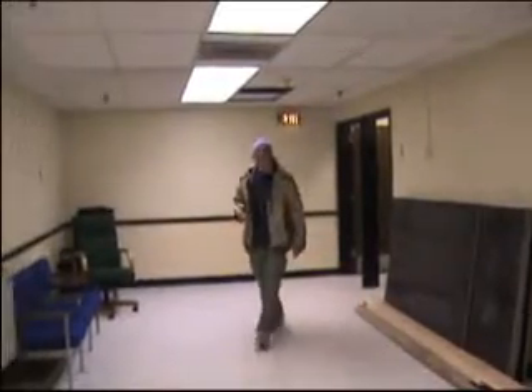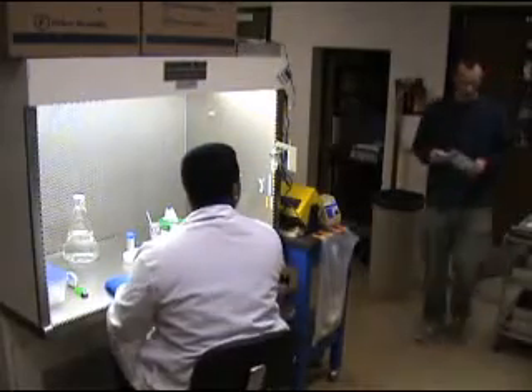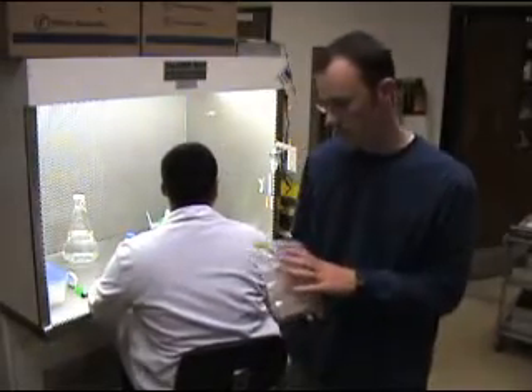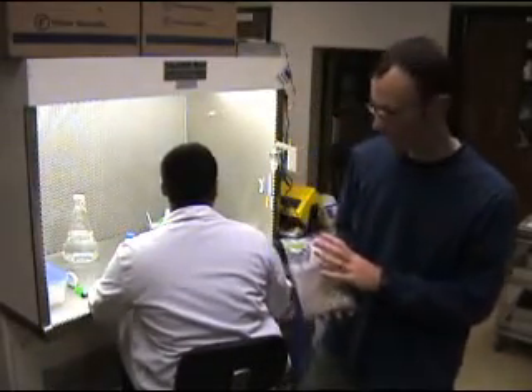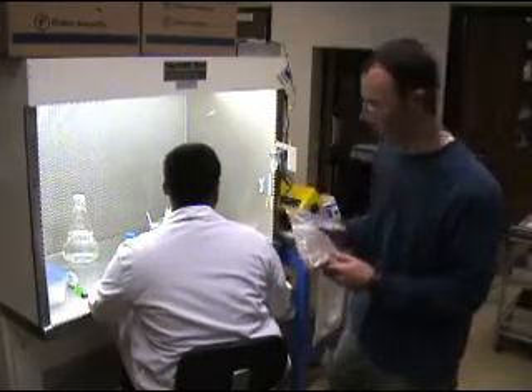We've brought our soil here from the field to Utah State University's Veterinary and Science Building, where they have an insect pathology lab. We can have it tested to see if there is any native fungi in it that might be potential pathogens. After we bring the dirt in from the field, the first thing we do is catalog it in a computer and assign it a soil sample ID that will help us track it through the whole process of isolating the pathogens.